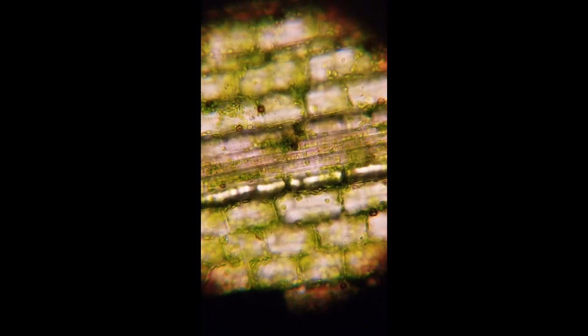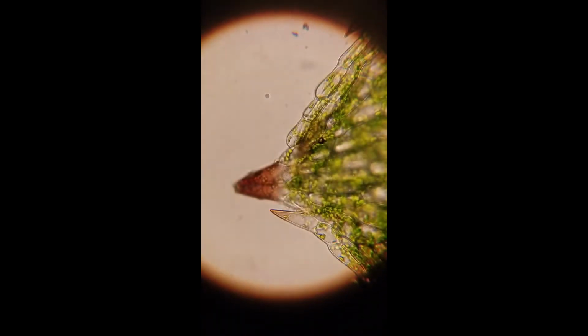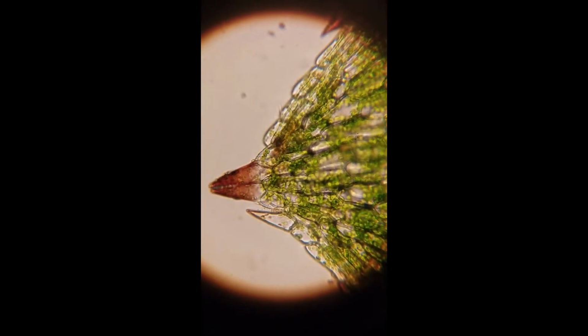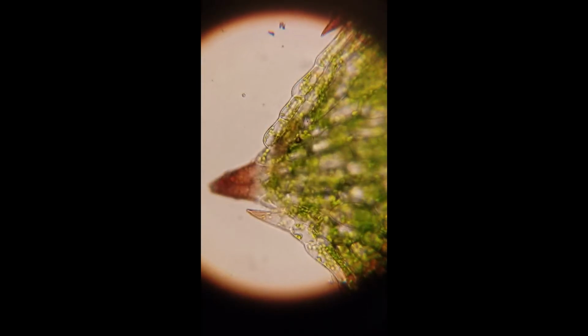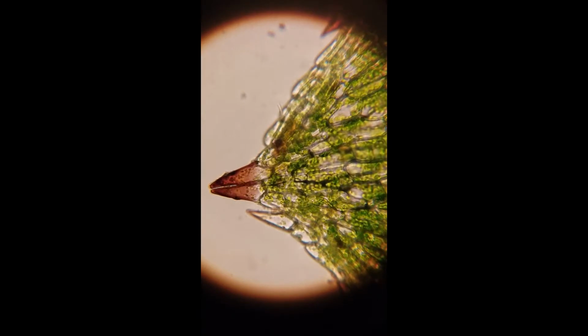I'd like to move on to the tip of the leaf. Just keep moving over. And there's the tip of the leaf. Now I'm sure that if we opened up a biology book, they would have much more to say about these special cells on the tip of a leaf.